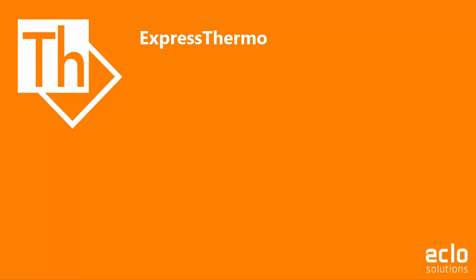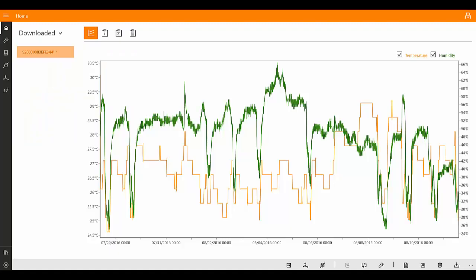Welcome. This tutorial will show you how to program a logger with Eclo ExpressThermo Windows 10 application. ExpressThermo makes it very easy to program a logger. You can start the programming from either the main menu or from the commands bar in the main page.